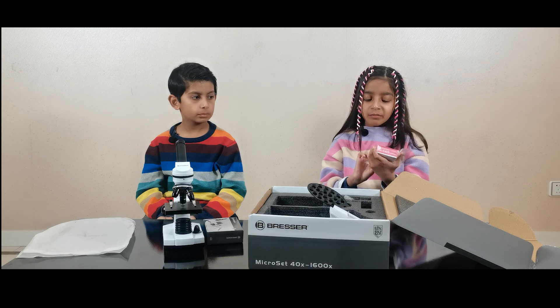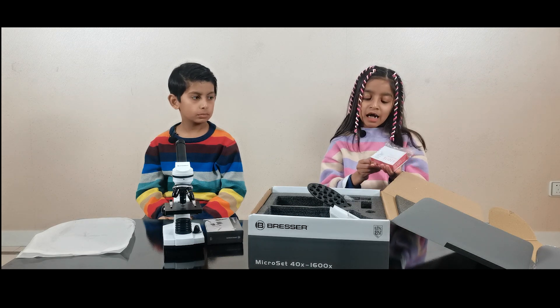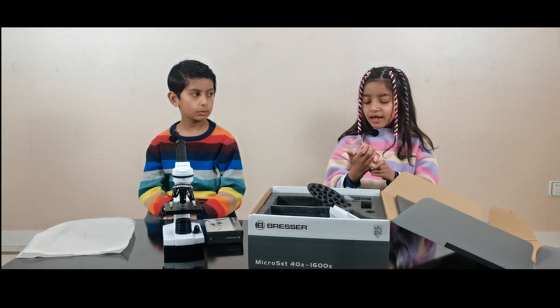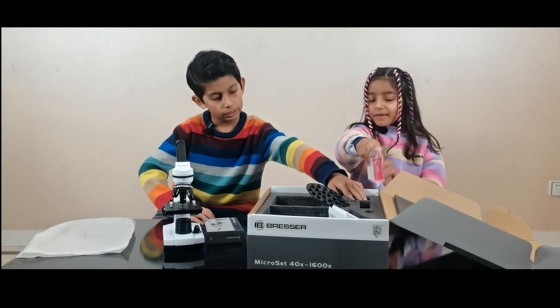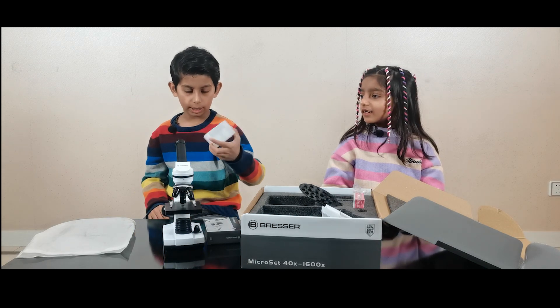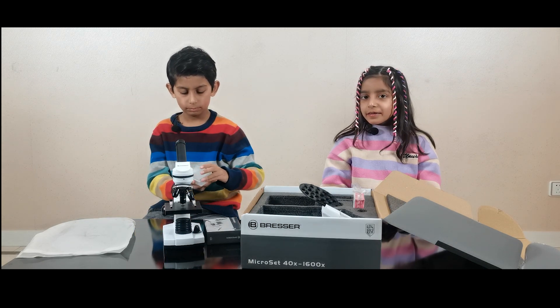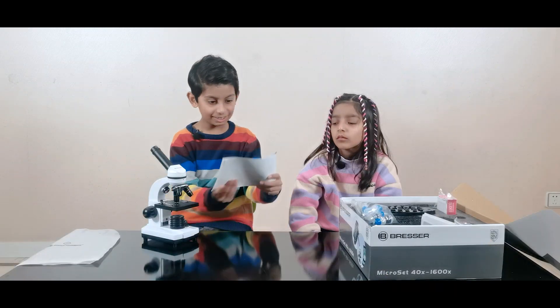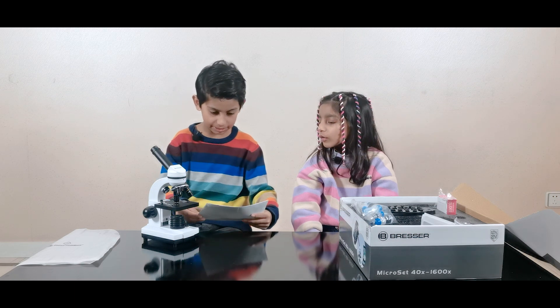Here are some tools to make the slides. These are some microscope slides that you can see things in. Guys, look, there's an introduction book!